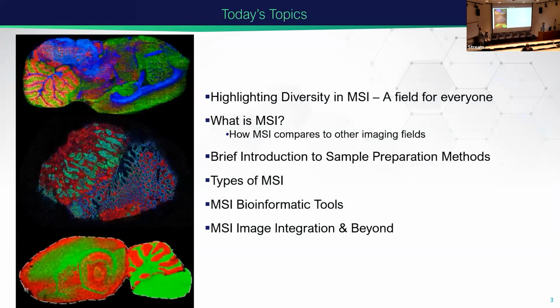So without further ado, I will first talk about highlighting diversity in mass spec imaging and highlight that I believe it really is a field for everyone. Then Kevin will cover what exactly MSI is and how MSI compares to other imaging fields that are out there. Then Dušan will talk about a brief introduction to sample preparation methods.